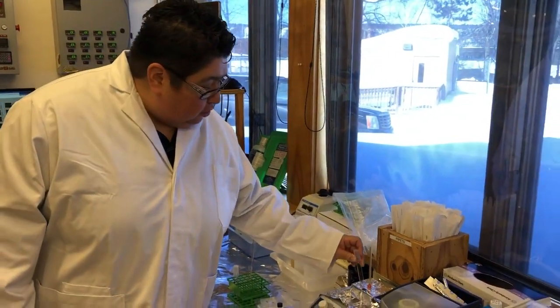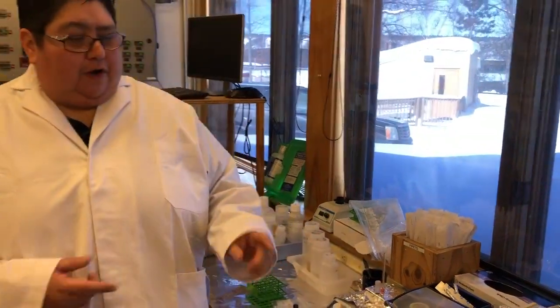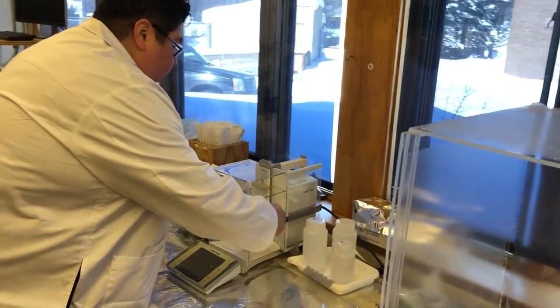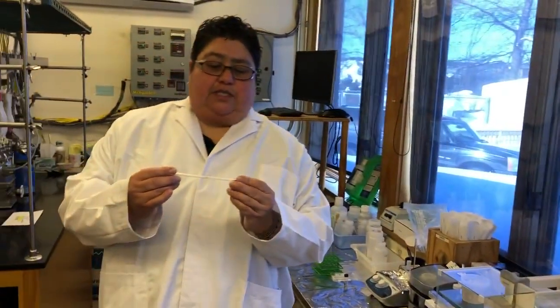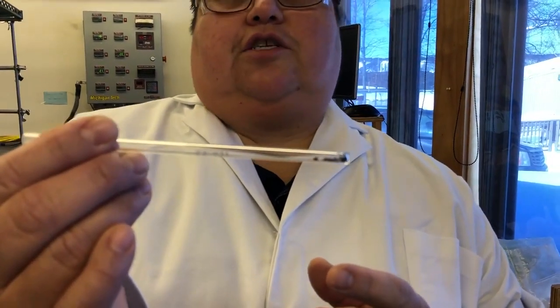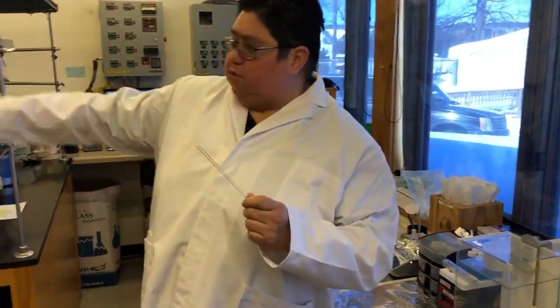So once the sample is dried, I'll walk over here to my weigh station, and here I can take my sample. I've got one ready already, and I can weigh my sample out into a combustion tube, and I add an oxygen source. Most of what you see in there is actually the oxygen source. And the reason I do that is because we're going to head over to my torching station, if we may.